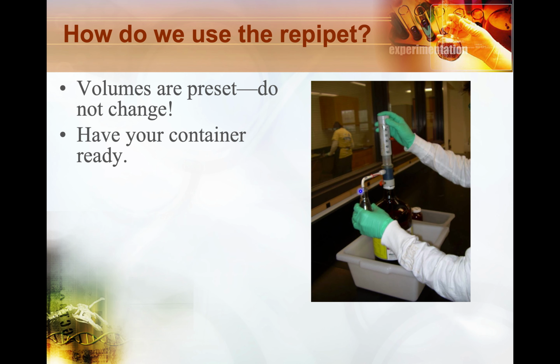When you're ready, you'll have your container with the zinc and the iodine in it, and you'll put it up next to the spigot.